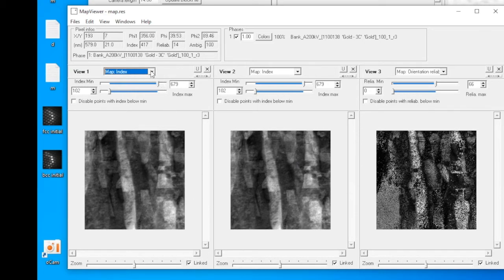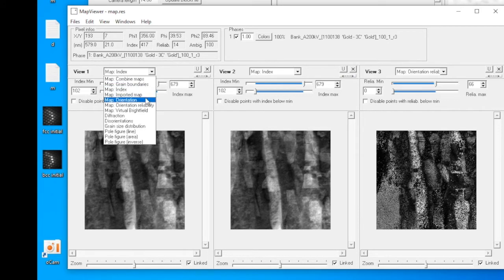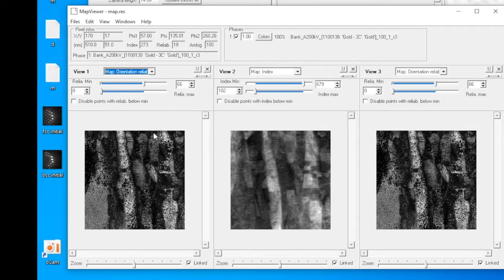We'll skip the imported map, and you've seen the orientation map. Next, we'll select the orientation reliability map. In the orientation reliability map, it compares how good the best match is to the second best match. If the best match is way better than the second best match, then the pixel will appear to be bright.